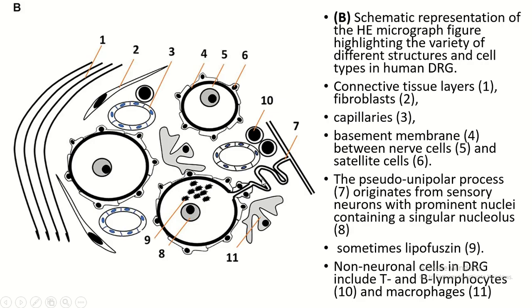Microscopic structures present within the dorsal root ganglia: this is the connective tissue coat, this is fibroblasts, this is a capillary, this is lymphocytes, and this is a macrophage.